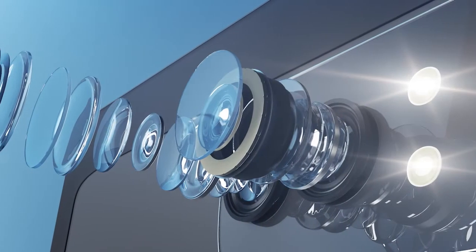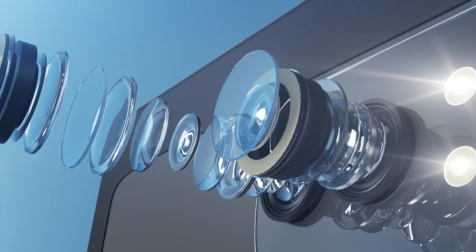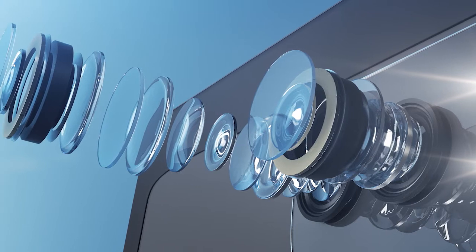In addition, this optical technique enables the simultaneous measurement of up to 31 layers.